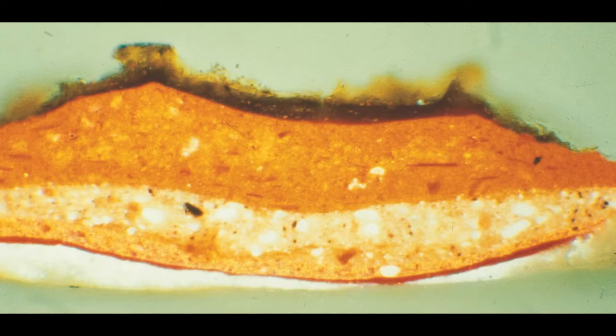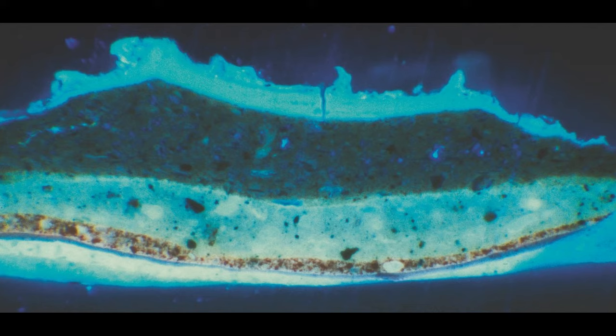Microphotography involves shooting a particular detail under a microscope with a 50 to 400 times magnification. First, it provides an image of the specific point to be examined. For example, after a microscopic examination, the technique either captures an image of the artist's own personal style, or it reveals an anomaly by highlighting the difference between the original material and material added to the work at a later date. In addition, the technique provides an image of a microsample strata, which means that before the possible destruction by chemical analysis of a microscopic sample of pictorial matter, we can capture the successive layers of the sample by photograph under a microscope.